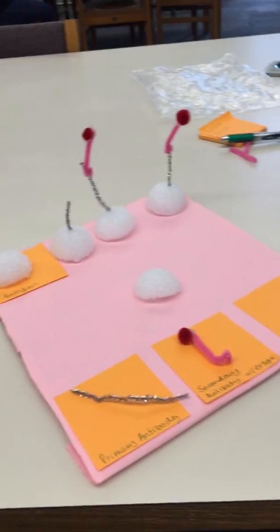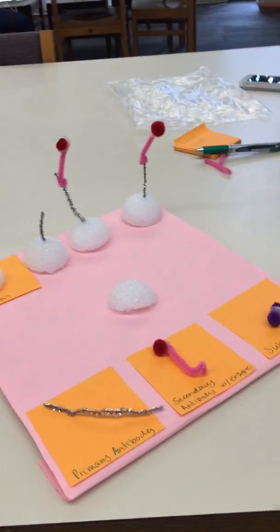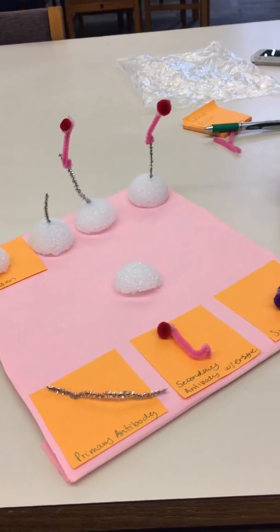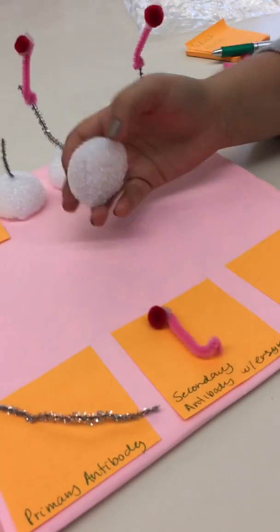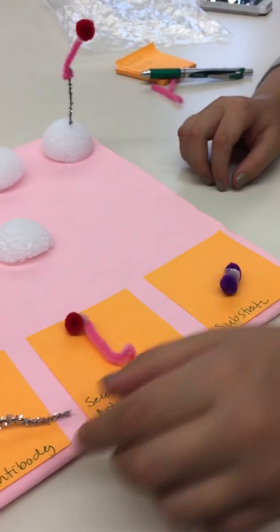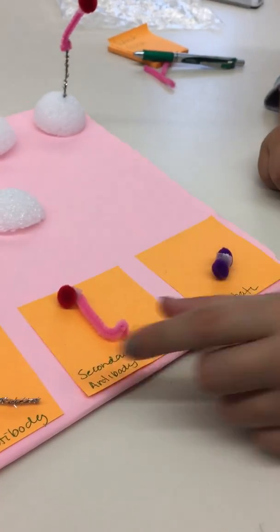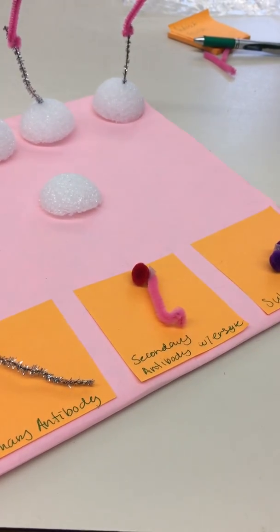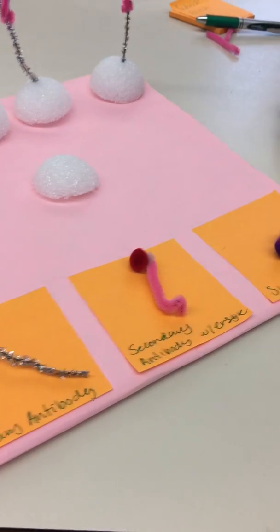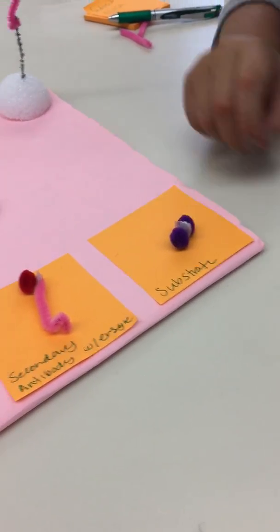This is a model representing the indirect ELISA test, which allows you to test for different antigens and what they correspond to. Each of these half circles represents our antigens, which are taken from the cell of an organism. Each of these silver pipe cleaners represents our primary antibodies, with the pink pipe cleaners representing our secondary antibodies, and the red puffballs representing our enzymes. The double purple puffballs represent our substrate.